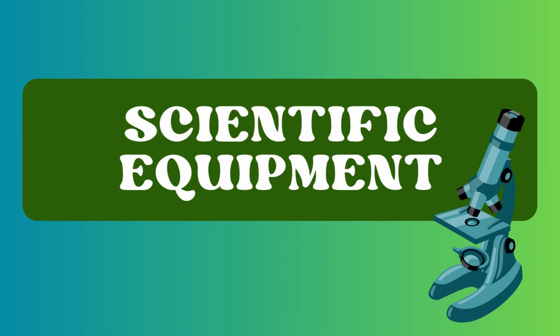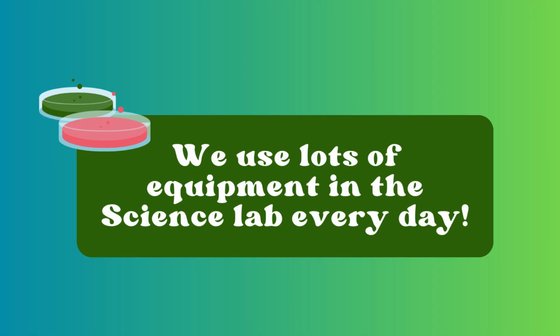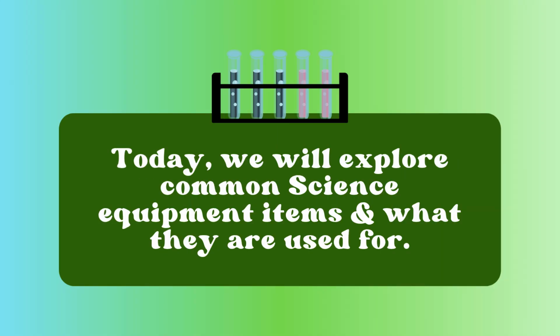Have you ever wondered about the tools scientists use in the lab every day? Today, we're going to explore some common scientific equipment and learn what they are used for.